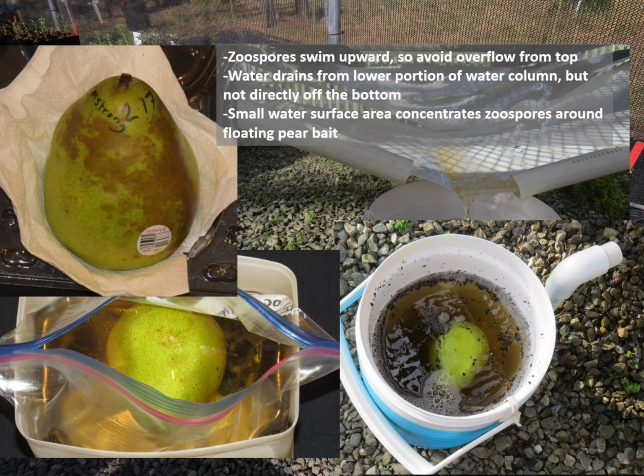Phytophthora causes fairly characteristic lesions. They're a little bit variable, but once you understand what they look like, they're easy to determine, and they can be verified by means of culturing or by means of various molecular methods as well.